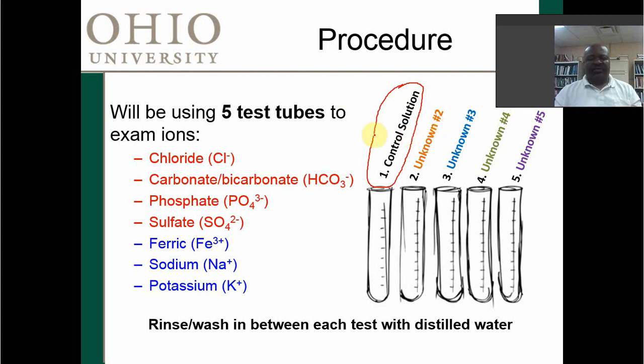Whatever test we're performing, since we know this is chloride in this example, we'll be able to see exactly what the test reveals, whether it's a change of color or whatever is going on. So we'll know what the result for the chloride test is, and then we'll compare within 1, 2, 3, 4 which one of these matches the control. And we do that for all of these, so we have the control and we match them in order to see which one's a good fit.